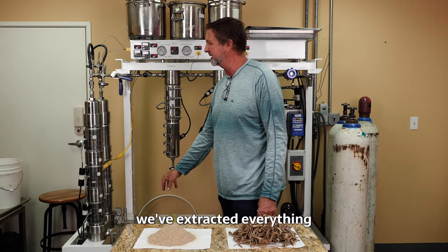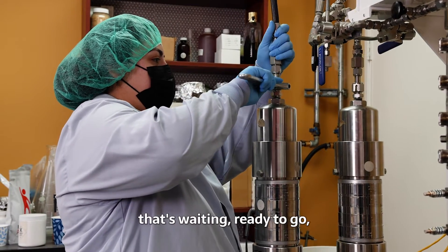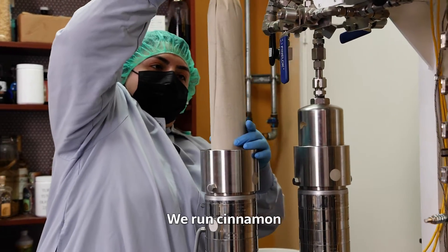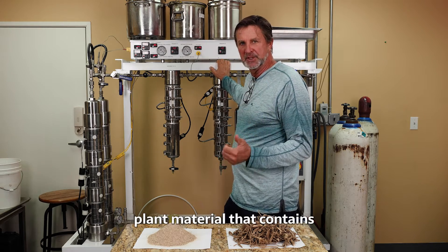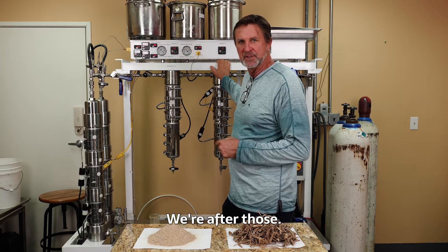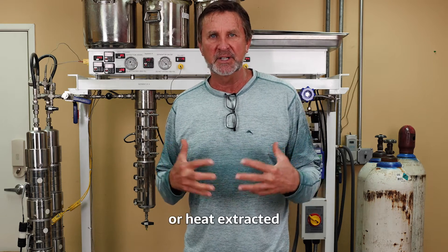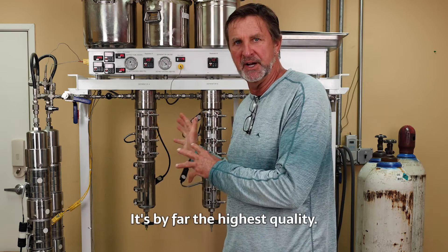When we feel that we've extracted everything, we switch this particular tube over to another tube that's waiting and ready to go. We unload this one, add new material to it, and go right back to it again — constantly cycling between these two chambers, about four kilos at a time. We run cinnamon, cloves, vanilla beans, lavender, roses — any dried plant material that contains essential oils or natural compounds. If I want to make a really high-end flavor or perfume and I want the best — not heat-affected or alcohol-extracted compounds — I'm going to do CO2. That's by far the highest quality.